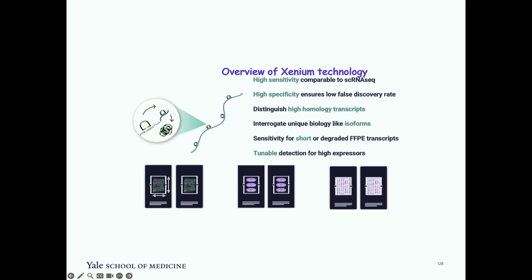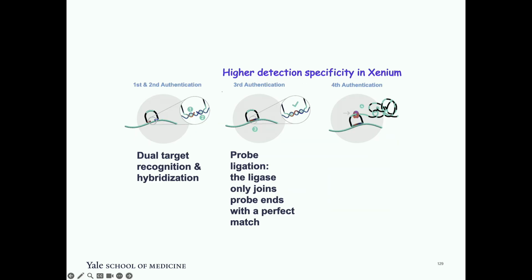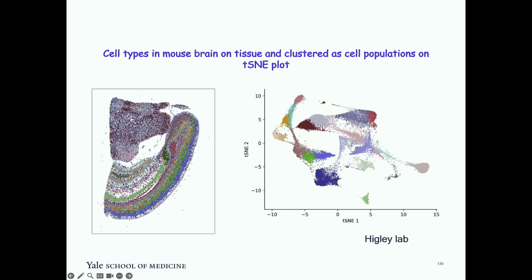The specificity comes from the 2 probes used for each gene, because binding of 2 non-specific fragments to the same complementary DNA is actually not possible. That way you get very high specificity. Here, before doing the amplification, the padlock probes ligate to each other and make a circle structure, and then they do a rolling circle amplification. That is how they achieve this.